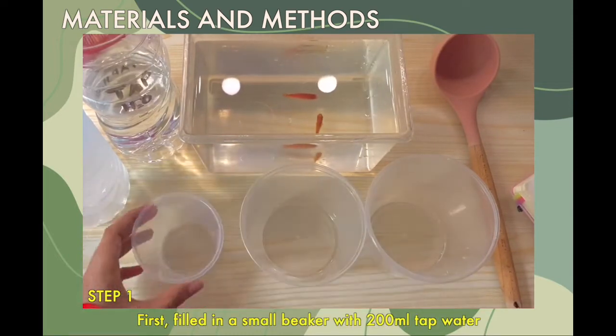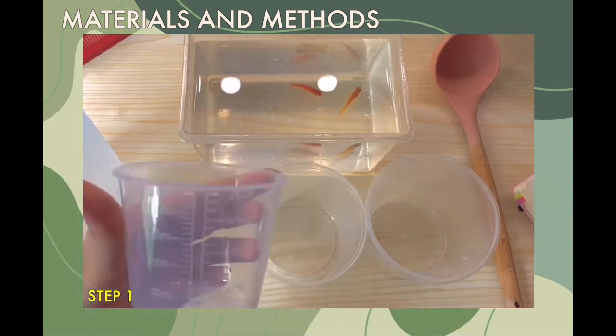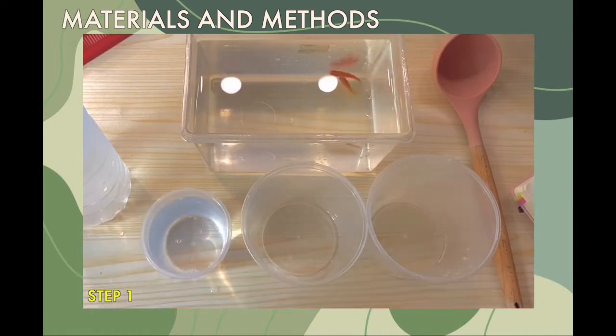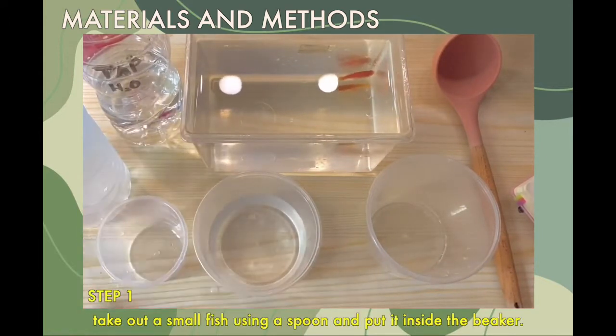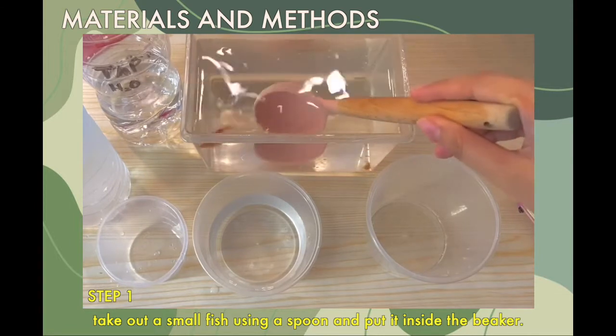First, fill a small beaker with 200 ml of tap water. Take out the small fish using a spoon and put it inside the beaker.